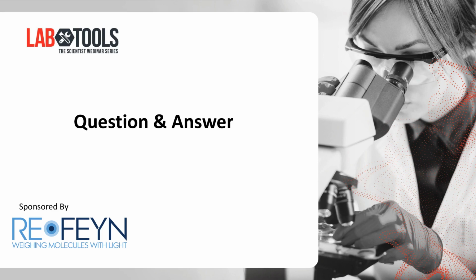And there's a question about different kinds of antibodies that asks whether you've looked at other types such as nanobodies with or without Fc fusions, and if there are advantages in respect to avidity compared to classical IgGs. Yeah, that's also a really great question. We're really interested in it because with these nanobodies, especially these fusions, obviously one of the main advantages that they report is these avidity effects. The short answer is we haven't, mostly because of a lack of sample. If whoever asked that question had some interesting nanobodies, we'd be more than happy to look into it. But yeah, we would expect that these assays would be quite sensitive for studying nanobodies and other such things.